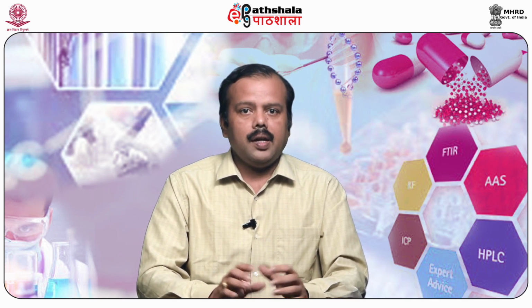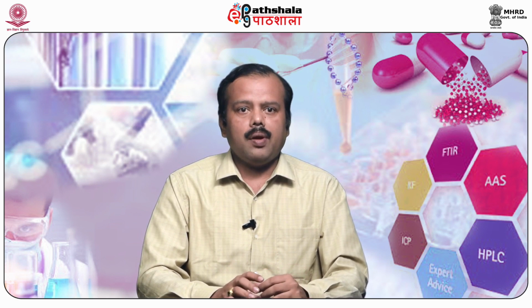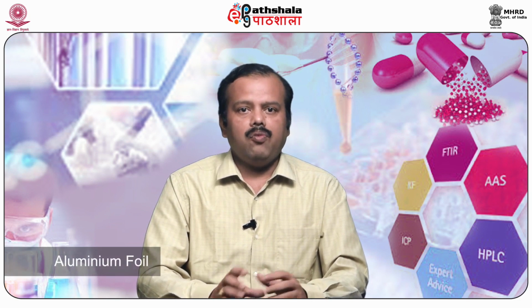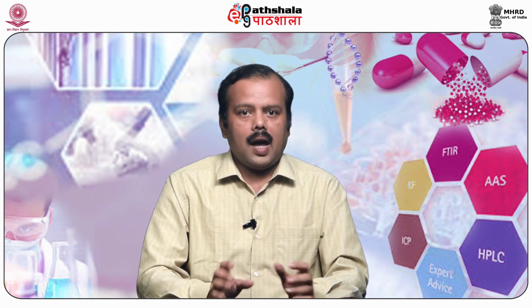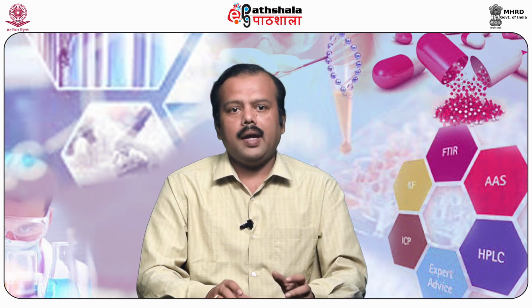The glassware used is plugged with non-absorbable cotton and wrapped with aluminum foil before sterilization. The glassware containing culture medium is sterilized by autoclave for 15 minutes at 15 psi pressure.